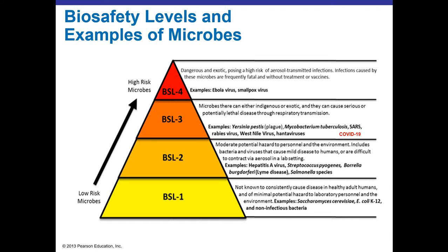BSL-4 is only for the most dangerous high-risk microbes. These are ones that almost always cause disease and are frequently fatal and often without treatment or vaccines. So think of things like Ebola and smallpox, which obviously are very highly pathogenic and potentially deadly organisms.